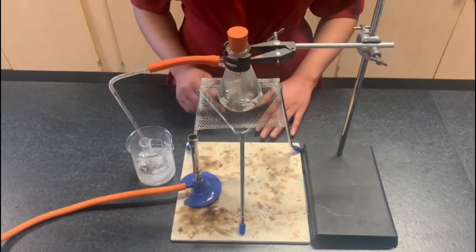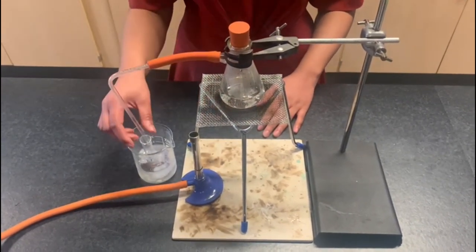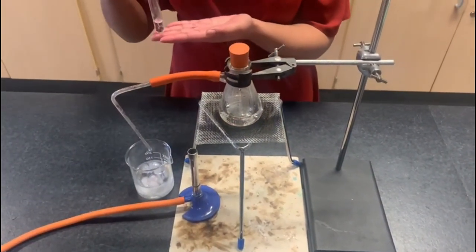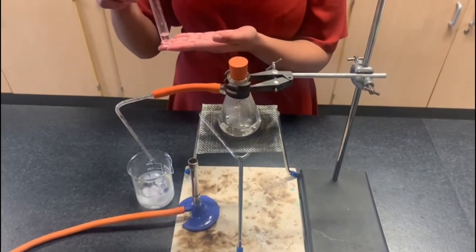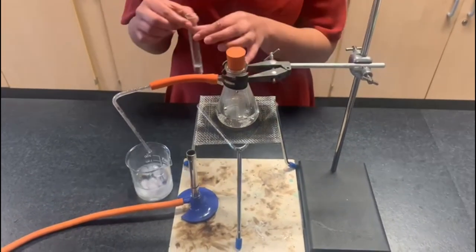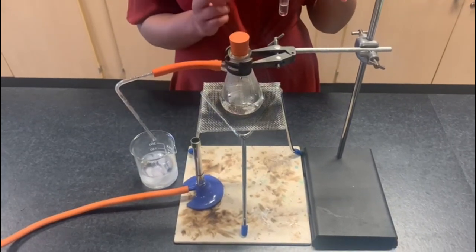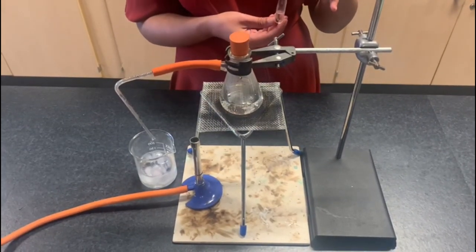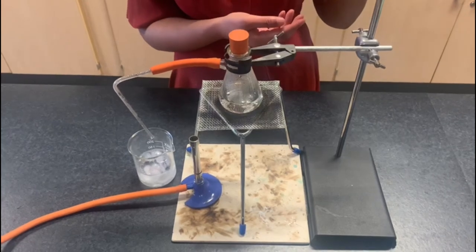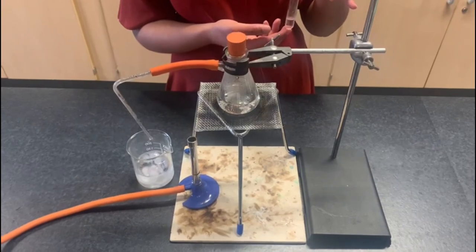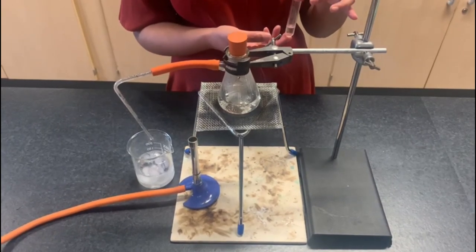This sample you then need to do activity one and two. I have now turned the Bunsen burner off. You need to turn it off once you have collected about two centimeters cubed of your sample. With this sample that you've collected you need to repeat activity one and activity two again. So activity one is to check the pH and activity two would be to collect any solids remaining.